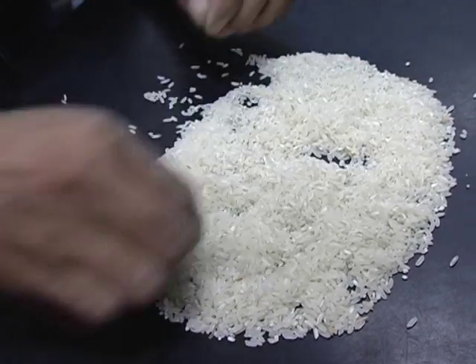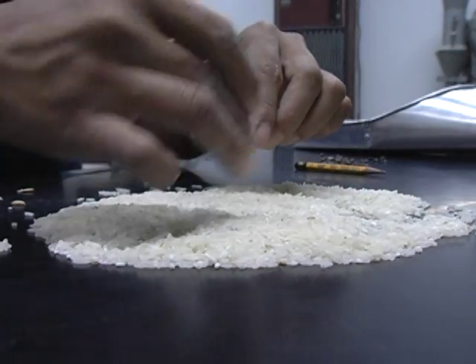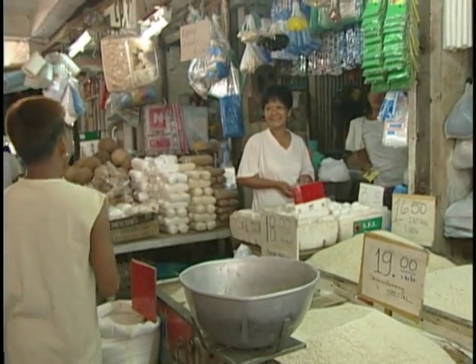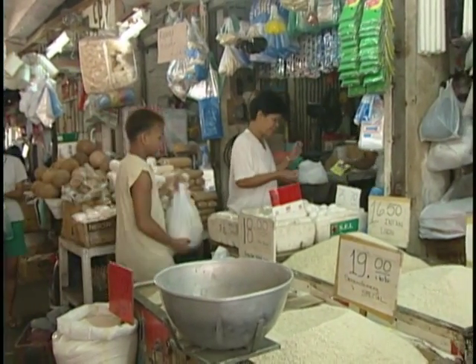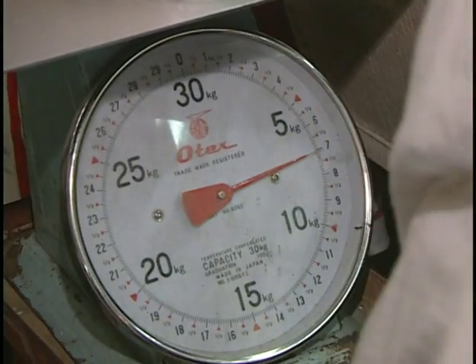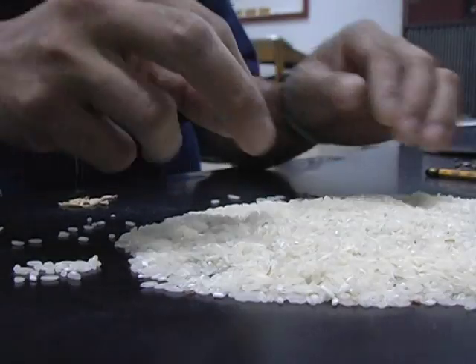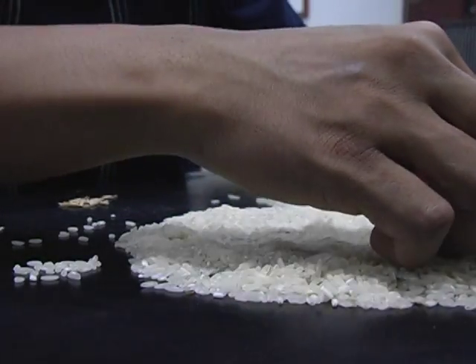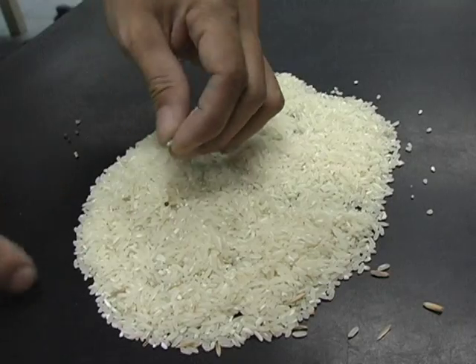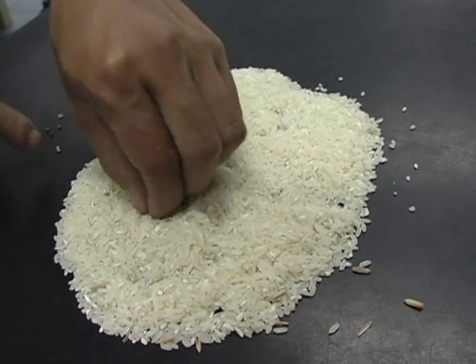Foreign matter in paddy reduces the milling recovery and the quality of rice. In milled rice, customers judge materials other than grain, or dockage, as one of the major reasons for discounting the price because you have less grain weight as basis. Dockage also gives grain an unclean appearance and may discourage customers from buying it. The weight of foreign matter can be calculated as a percentage of your milled rice by calculating the dockage.